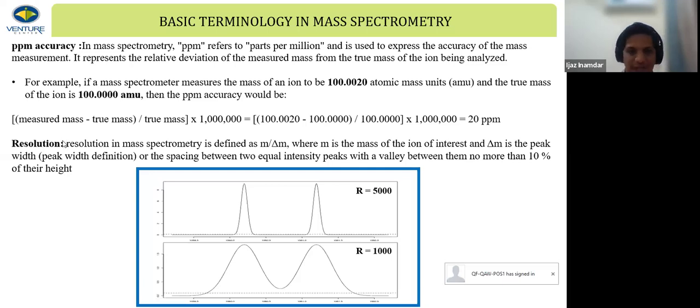The other important parameter is resolution. As I said, most of the time in your industry work, you're going to inject a complicated sample into the system. Suppose I'm injecting a sample that has two components in it. So it can be resolved this way. The distance between these two is basically known as resolution. The formula to calculate it is this, but it is basically known as resolution.